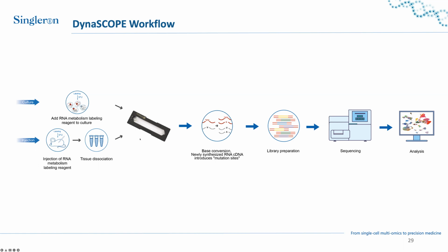After tissue dissociation, you will partition the cells, lyse the cells, and capture the mRNA.